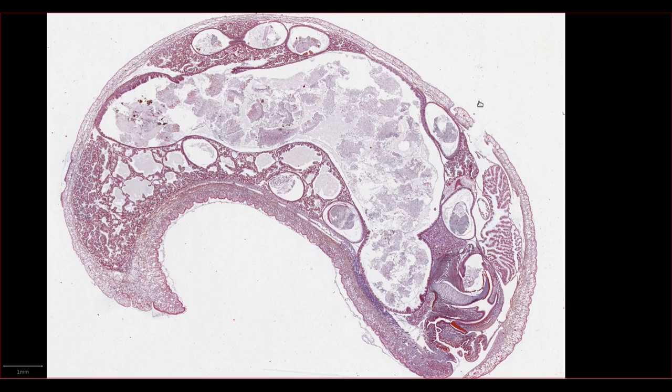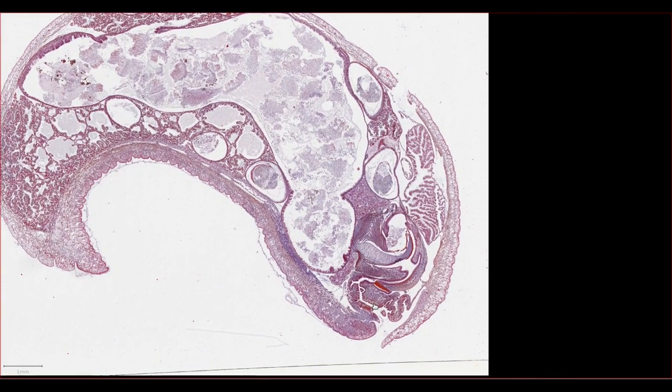We can identify the head, over here, by the presence of structures we would associate with the mouth, such as the radula, which means that the other end of the specimen, over here, must be the other end of the snail. Since we used the radula to orientate ourselves, let's start off with the gastrointestinal tract, which is filling up most of this slide.